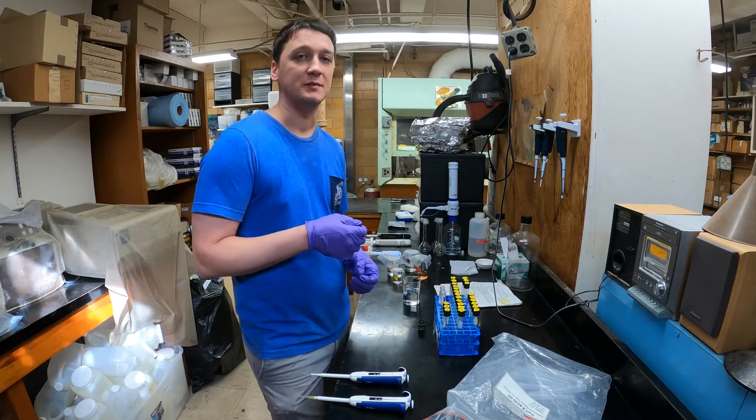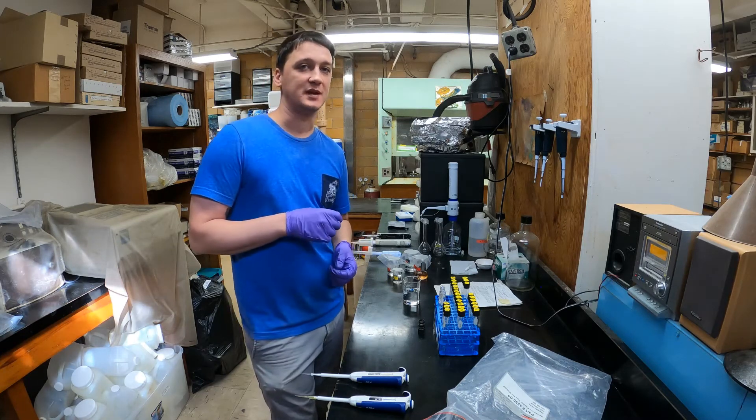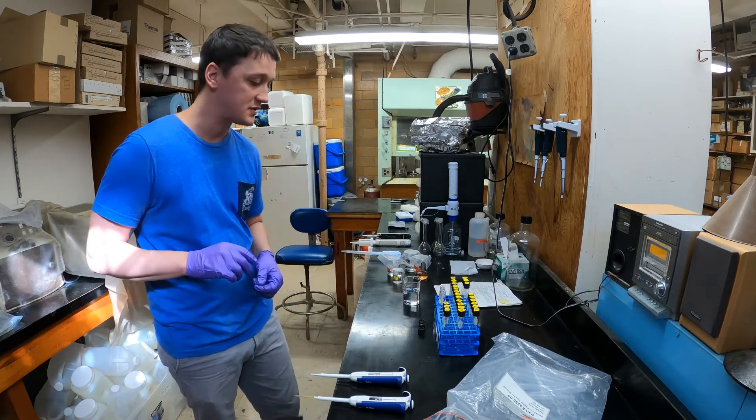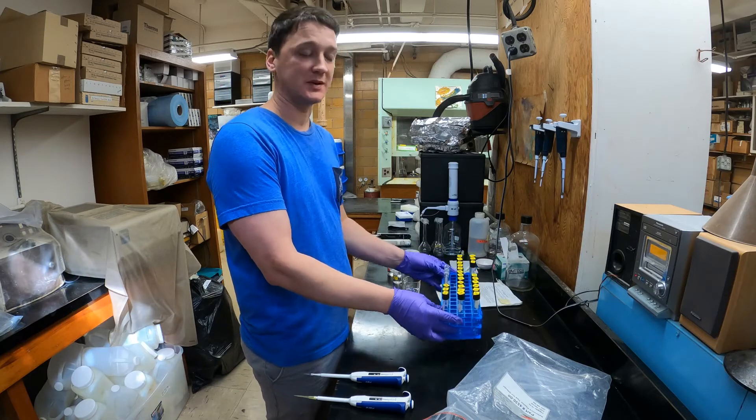The catalyst is called sodium nitroprusside — that's just going to speed up the reaction that produces the blue color. To start, I've got a whole rack of acid-washed test tubes here.